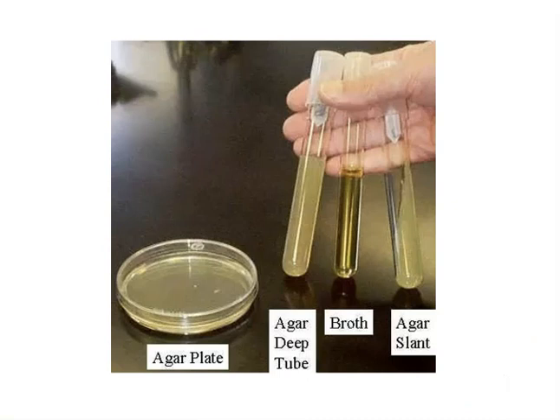On this slide, you're looking at some very common culture containers. Over here on the left, we can see an agar plate. The agar plate has agar poured into it. Remember, we mix up a powdered agar with water in the laboratory, and we can add all kinds of other ingredients to that mix, depending on the type of media that we're trying to make. We then heat that up until the agar melts, and we pour it into the plate. Once it's solidified, the agar will stay solid at both cooler temperatures like room temperature, all the way up to the higher temperatures that we use for incubation.